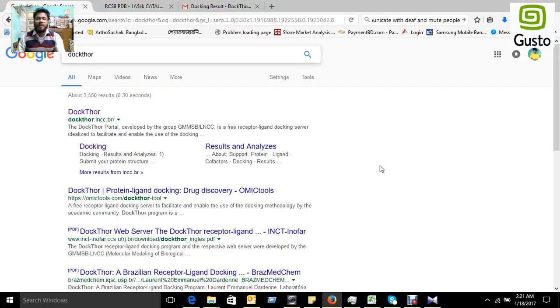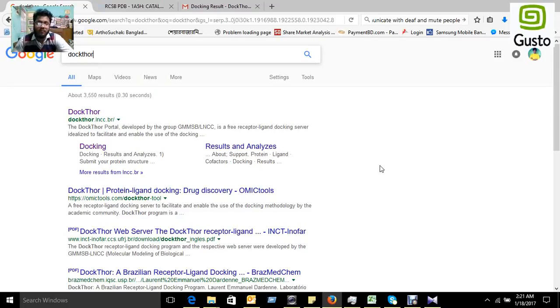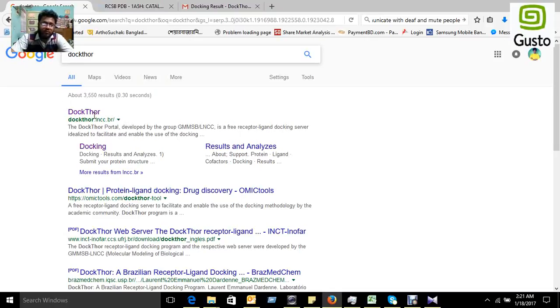Hi, Assalamu Alaikum. Today I'll teach you how to perform molecular docking using Dockthor portal. First we have to go to Google and write Dockthor, then we get to this website. Click it.